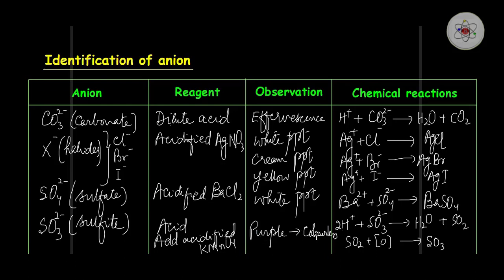So this observation is the evidence of sulfur dioxide gas in the test tube. And sulfur dioxide gas is only produced when the salt contains sulfite.